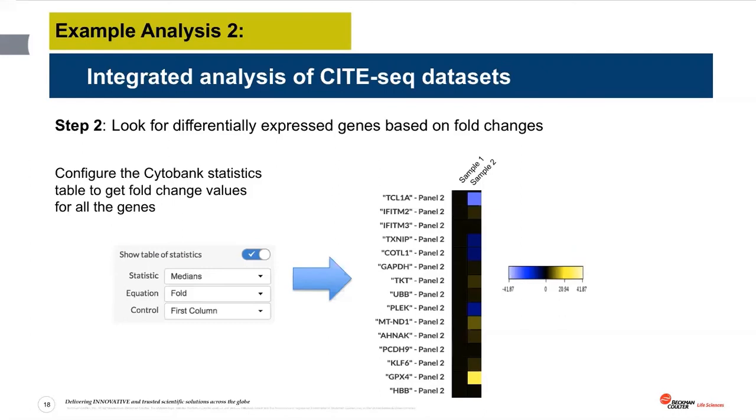I would like to mention that CITE-seq is a new technology, and there's no gold standard process in terms of how you should analyze your CITE-seq data.